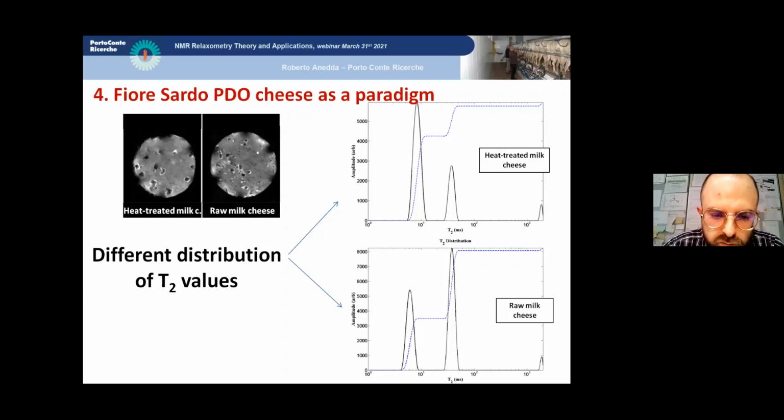are reversed in raw milk cheese, where the first population accounts for only about 40% of the total area. Interestingly, it has nothing to do with the total moisture content of the cheeses. And these results show that thermized milk cheese protein hydration is clearly affected by the production process. And in particular, it is affected by thermal treatments of milk, since all other parameters have been fixed in dedicated experiments. So cheeses have been produced ad hoc for these experiments.